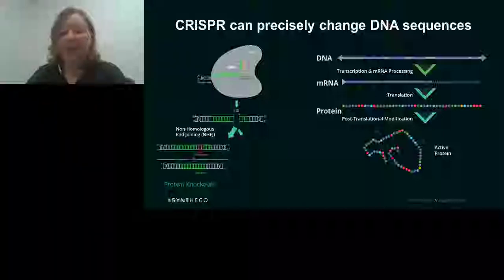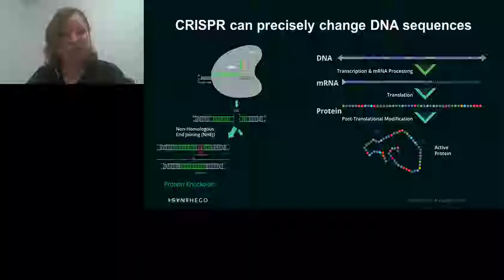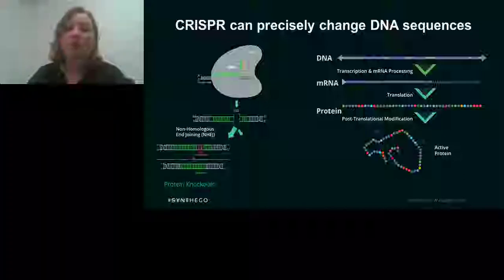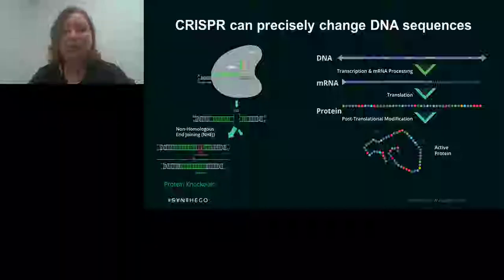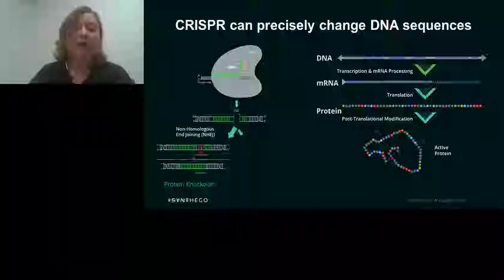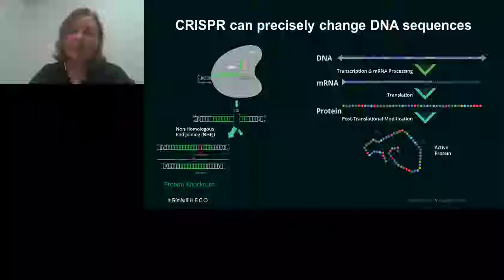And what typically happens with CRISPR-Cas9 when we get those insertions or deletions created is that we change the open reading frame that the mRNA utilizes, and that means that we get a premature stop codon at the protein level, which causes a truncation of the protein and usually nonsense-mediated decay, to then have a knockout of protein function. So using non-homologous end joining, we can get that complete protein knockout. But then there's also another side of CRISPR that we can utilize.